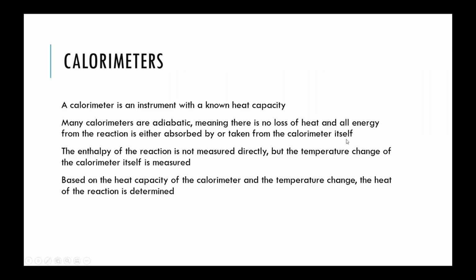So if you know the heat capacity of the calorimeter, or at least of the different components of the calorimeter, and measure the temperature change, you can calculate the individual enthalpy associated with that temperature change for each of the different components, add them all together, and then that would be the energy that was released from the reaction and absorbed by the calorimeter itself.